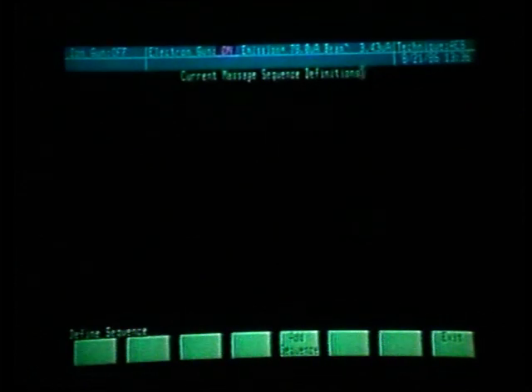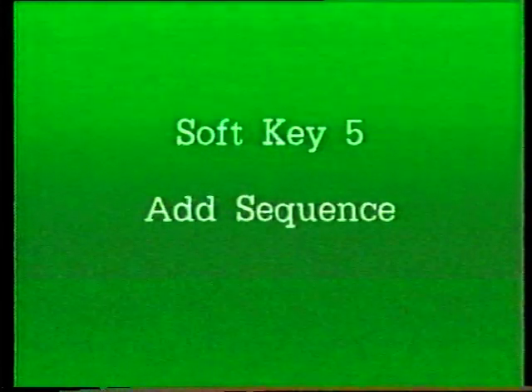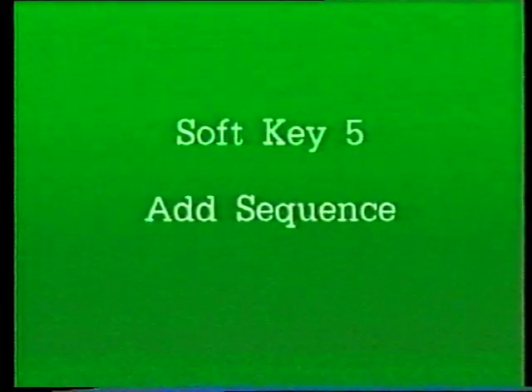The current massage sequences that we have defined is blank because we have none defined using this menu. Soft key number 5 allows me to add a sequence.